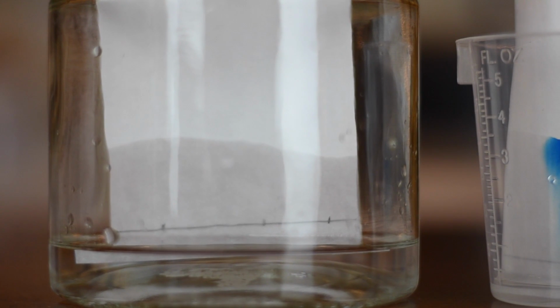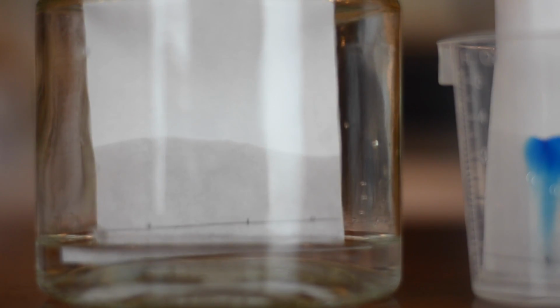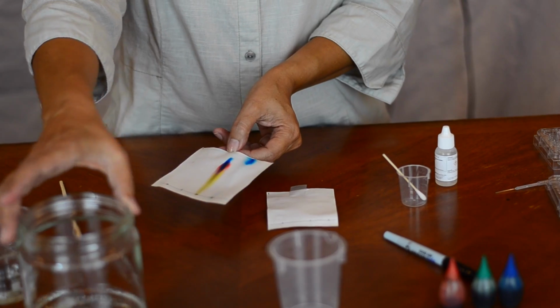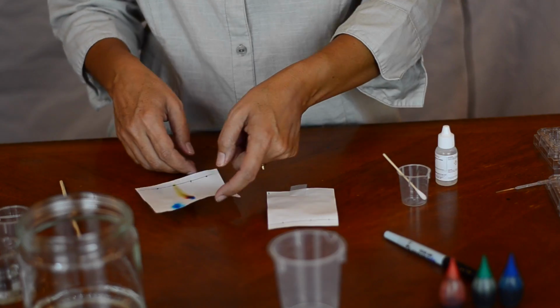Okay, so a few things have happened. The first is that the water has diffused up both of the paper chromatographs. This one I stopped when I had about 10 millimeters to go. This one, which was wrapped in the 150 ml plastic beaker, had about 5 millimeters to go. And I was glad I did mark the upper left-hand corners of these, because once they were wet, it was hard to tell which side was which.